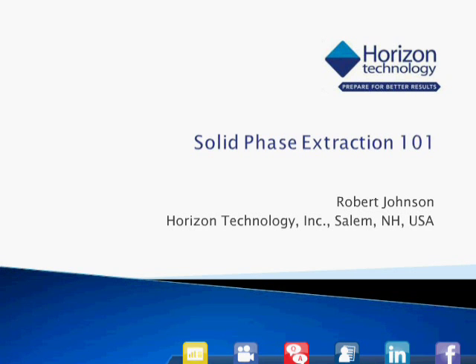As you can see from the title, we have called this Solid Phase Extraction 101. So this will be more of an introduction and elementary overview, but I will provide some useful tips, I think. So let me move on.